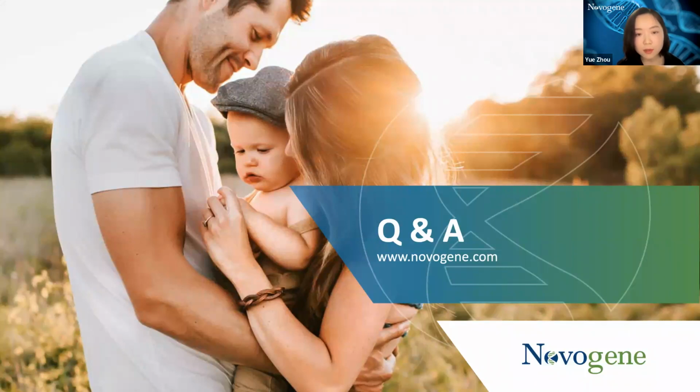We only take the uniquely mapped reads into the downstream analysis. So that's for the analysis. Yeah, thank you. Okay, thank you.